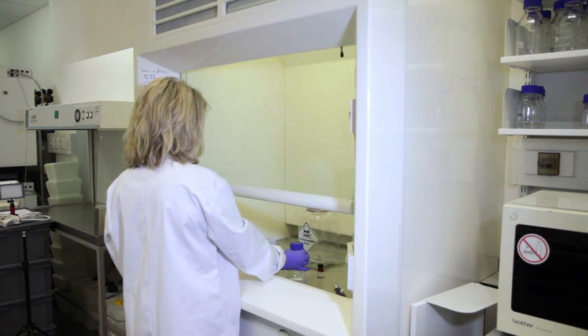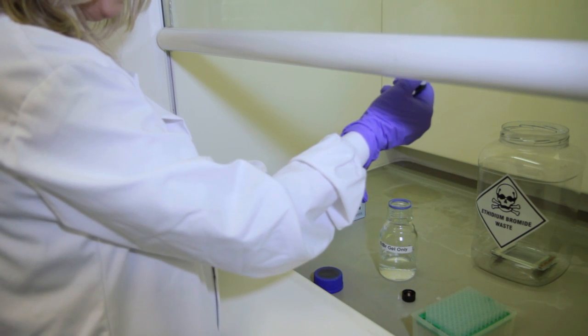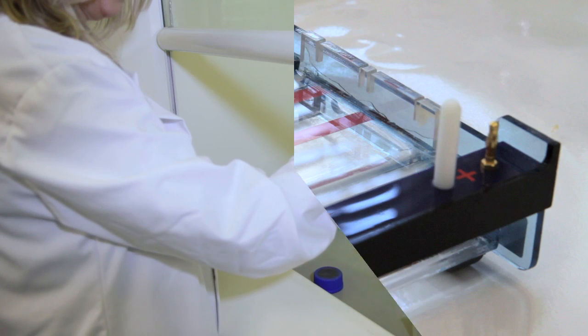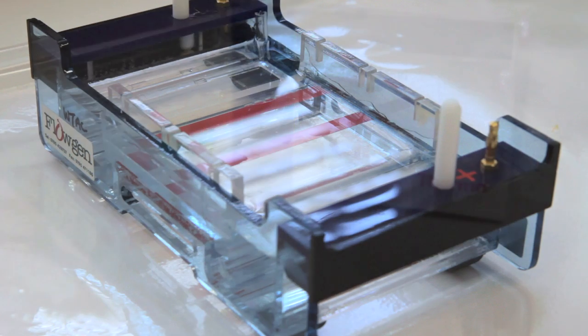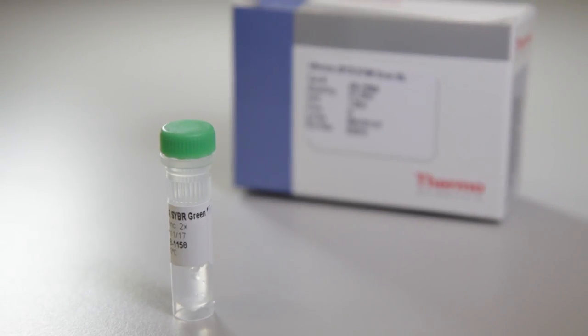To post-stain, add ethidium bromide to running buffer to 0.5 micrograms per ml and stain the gel for half an hour. Today we have used ethidium bromide, but other stains are commonly used including Cyber Green and other intercalators.